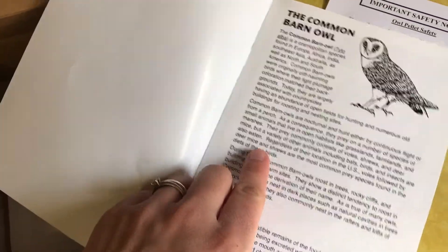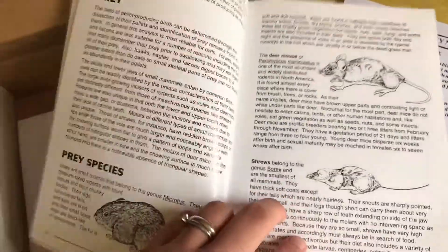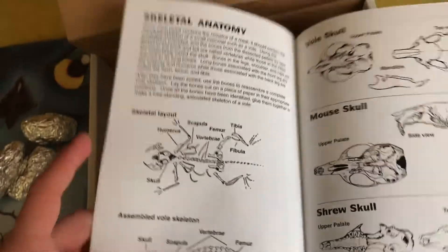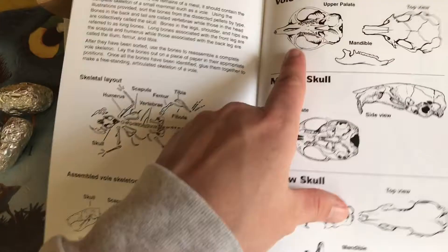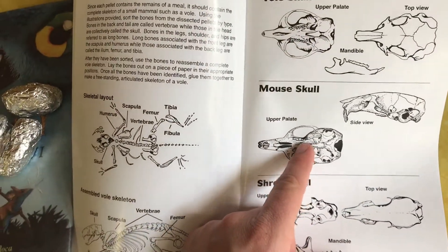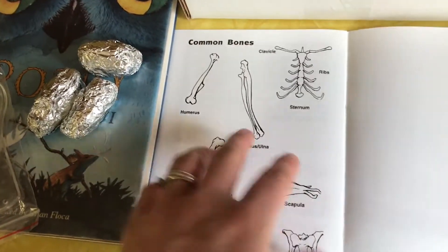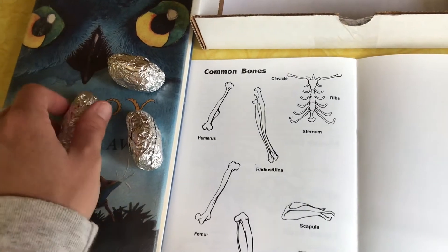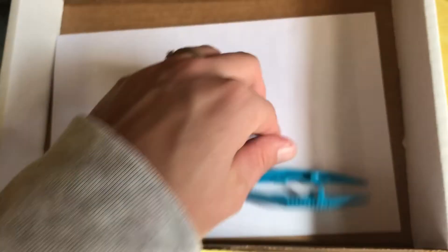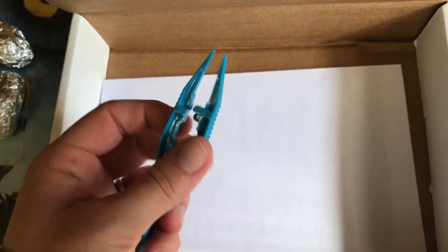It comes with a pellet guide — that's the main reason I chose this particular kit. I guess that's the kind of owl it comes from: the barn owl. It talks about the pellets and the different kinds of prey that owls eat. I like that it shows the anatomy of the mice and voles and stuff, so when we open up these pellets we can try to figure out what this owl ate. It also came with two wooden picks to pick these apart, and a pair of tweezers, which we'll probably just share.